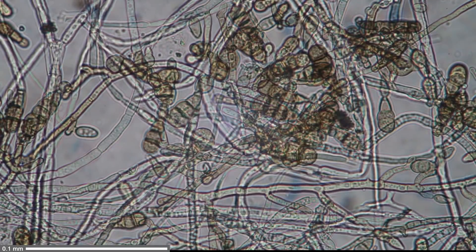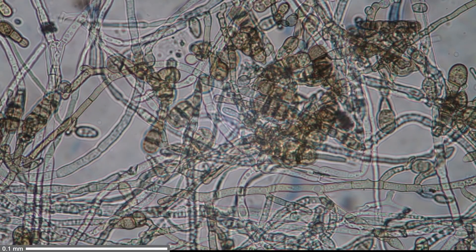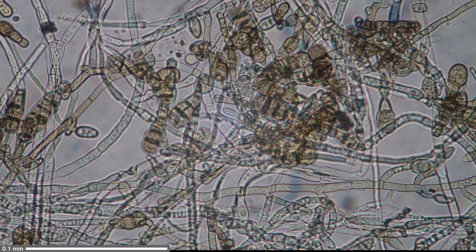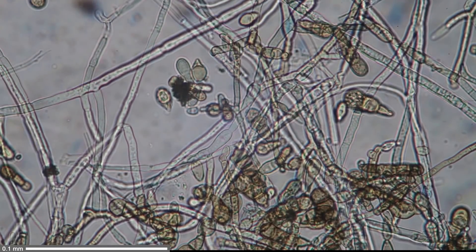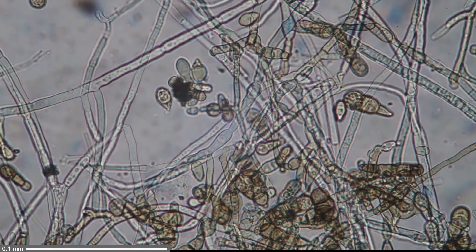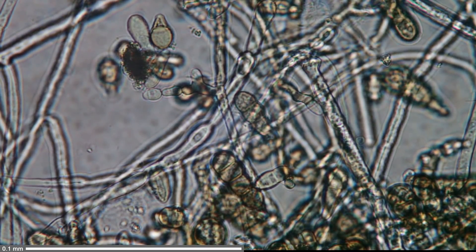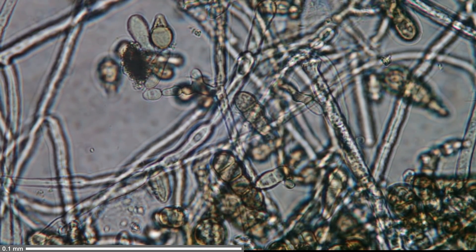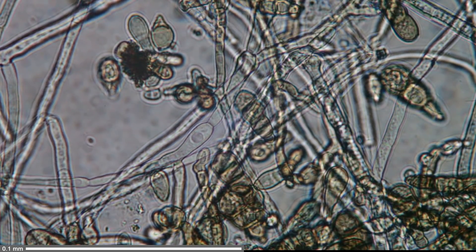You can also see the individual cells of the fungus, and if you look carefully you can see that they are branched — that branching of the mycelium cells is a typical characteristic indicating we are dealing with a mold. Also, if you notice in the background when I move the slide, there is some dust and dirt which remains stationary — that's a sign I need to give my microscope a little cleaning, as some dust has collected on the light source.